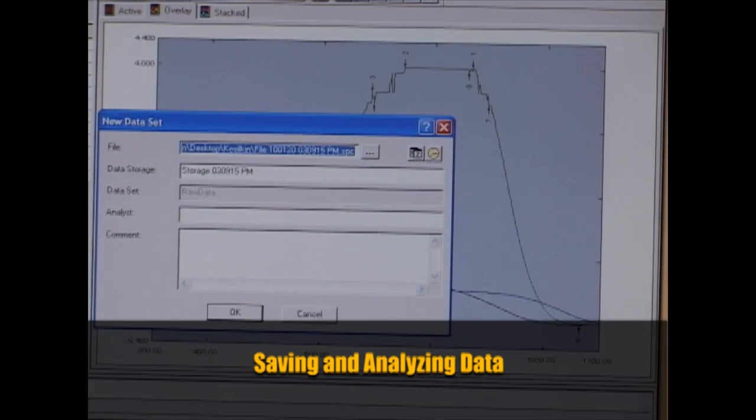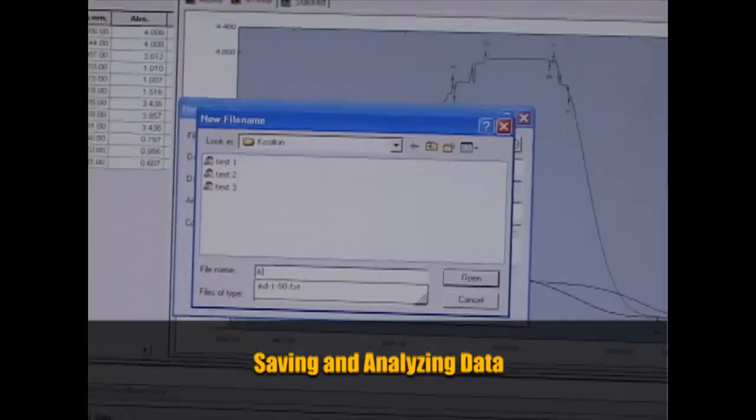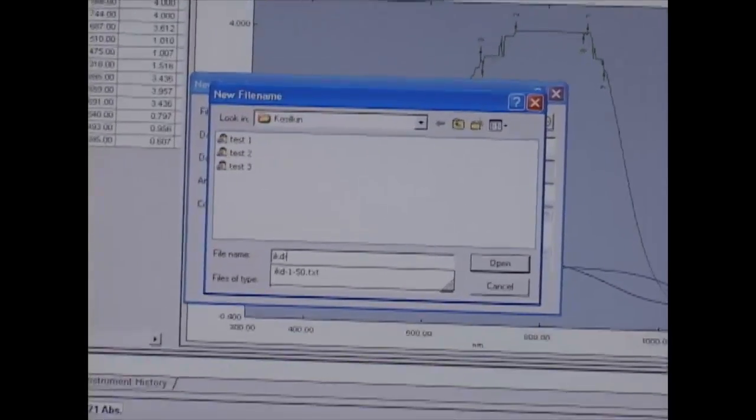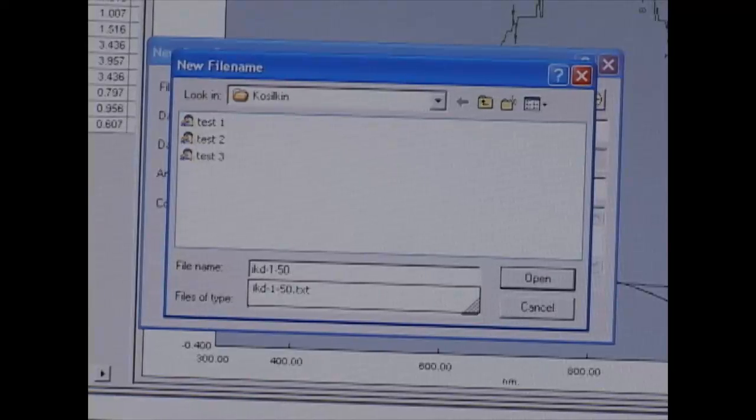When the run is over, computer will ask for file name. You can select path and name for file.